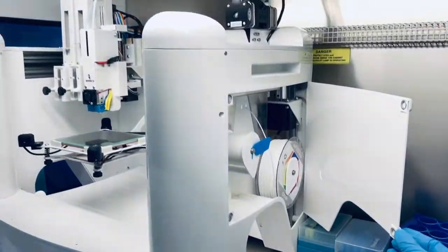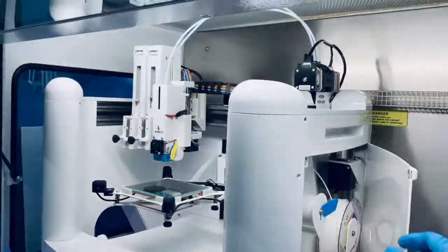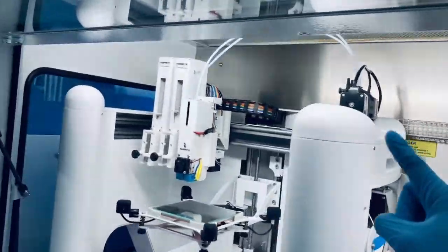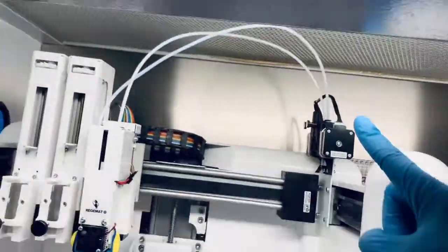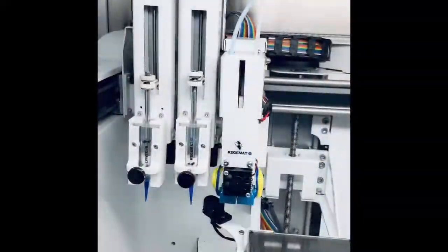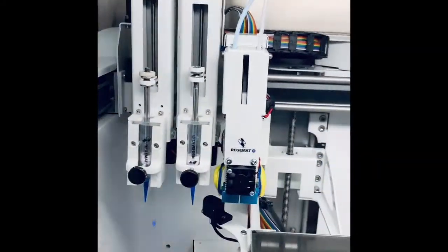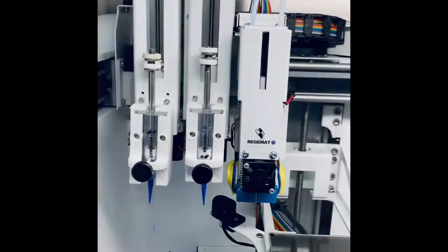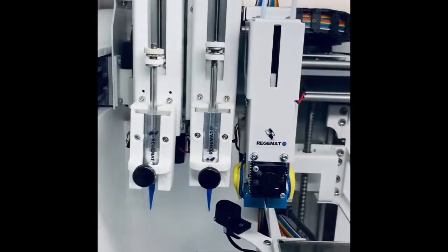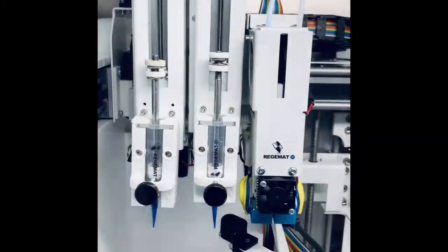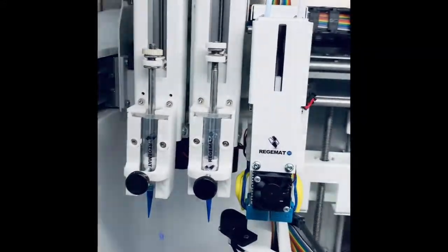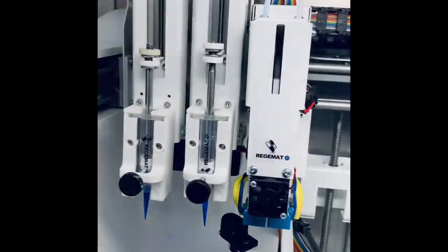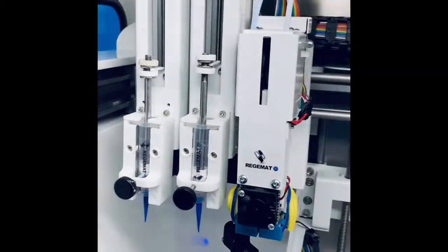As for the printhead, the system integrates an independent movement of the tools in the z-axis and a mechanical extrusion mechanism which allow both for the slow and gentle deposition of the biomaterials while working with sensible cell types, as well as high-pressure flow speeds for viscous and stiff hydrogels.